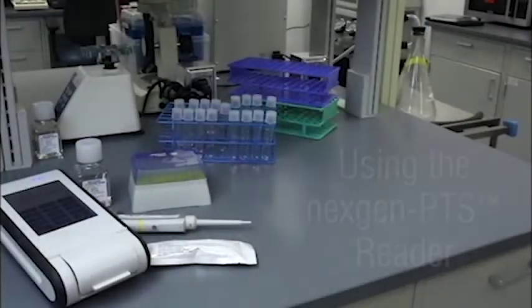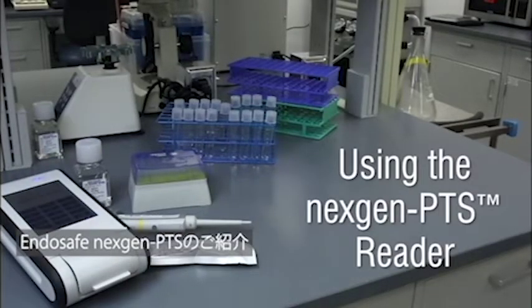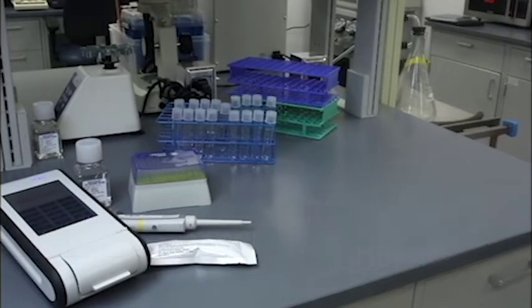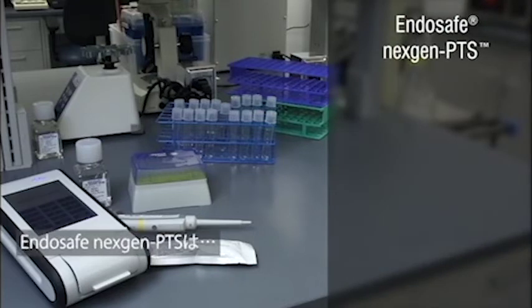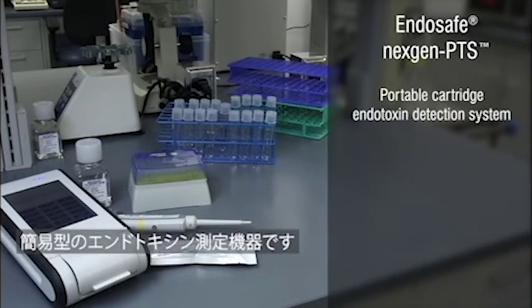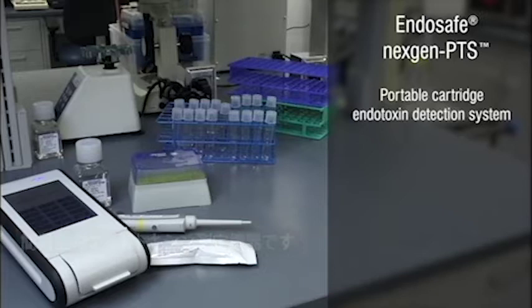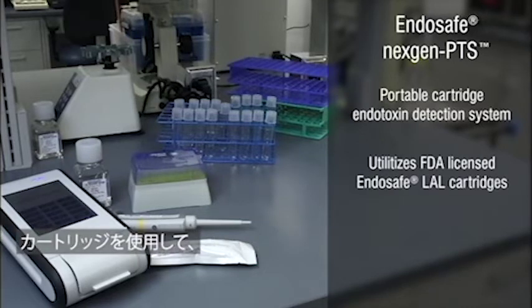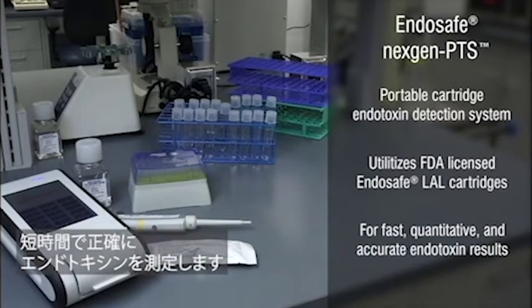Welcome to the EndoSafe NextGen PTS Virtual Demonstration. The EndoSafe NextGen PTS is a portable endotoxin detection system that utilizes FDA-licensed EndoSafe LAL cartridges for fast, quantitative, and accurate endotoxin results.